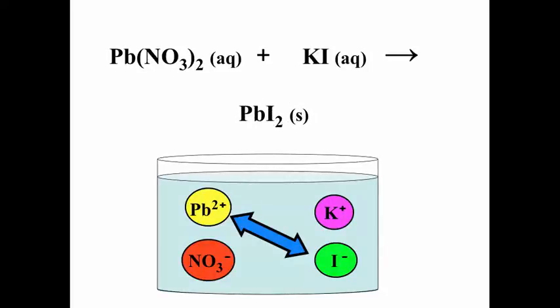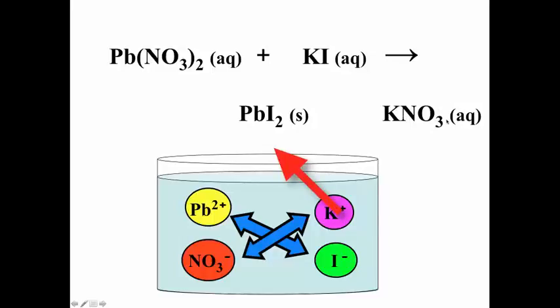with NO3-. It just so happens that the thing that is the actual solid is lead iodide, and the potassium nitrate turns out to be soluble. So how we choose to write that, PbI2(s), is the product that's visible, the yellow stuff that falls to the bottom, and then we associate the K+ and the NO3- together as an aqueous solution, even though those ions are, of course, really not stuck together in actual fact.